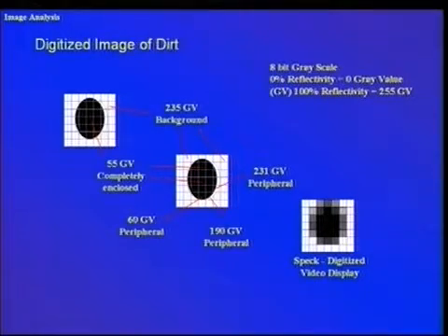But this edge effect is very important. As you go up in resolution, the edge effect becomes less and less of a factor in the image and improves the accuracy greatly, primarily because there are more subtended pixels than there are on the edge. So the weighting factor is very important, and it really is the resolution.